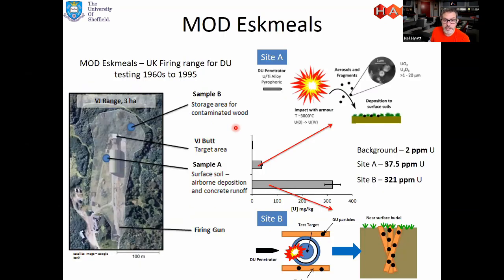This slide explains the source of the particles used in this study. One of the main uncertainties with DU particles in the environment is their long-term behavior. Wet oxic surface environments, and we have a lot of wet oxic surface environments in the UK, would be expected to promote corrosion of uranium oxide particles, which will affect the risk posed by the DU residues.